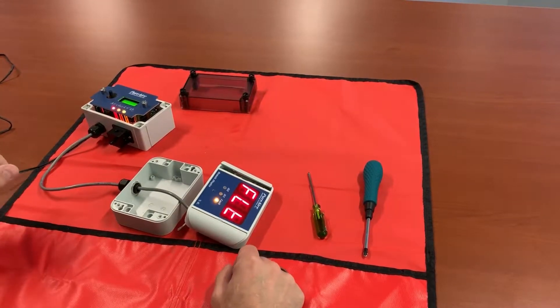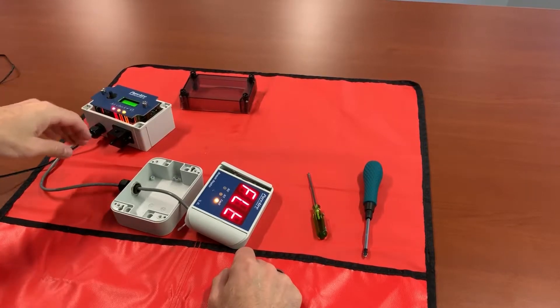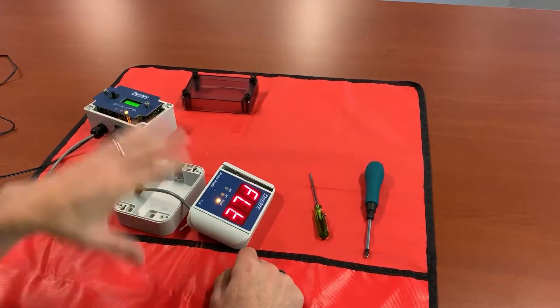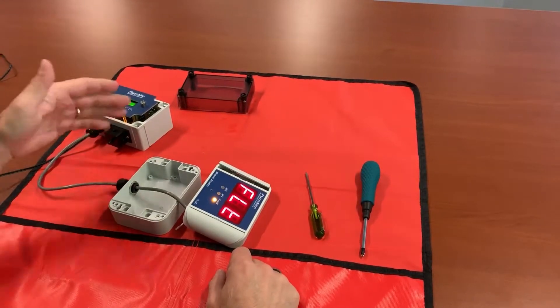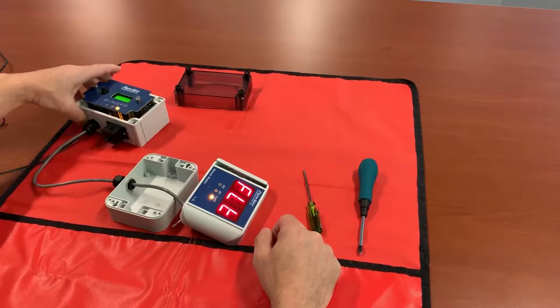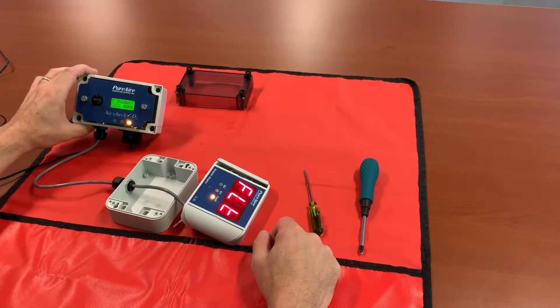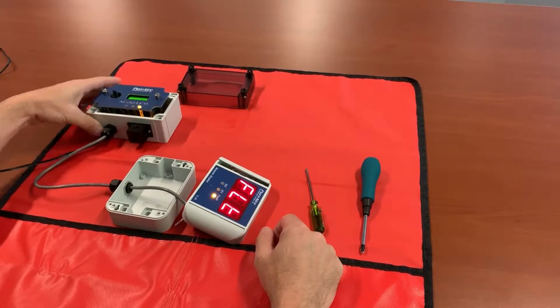You'll notice while the monitor is going through its warm-up phase that your remote display is going to say 'fault' — don't worry about that, that's totally fine. What it means is you don't have a four milliamp signal going to your monitor, so the remote display thinks it's in fault. At this point we're going to wait our 235 seconds and then we'll sync our remote display.